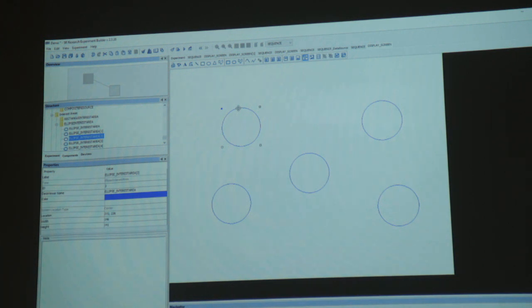Again, the participant cannot see what the interest area is, so it does not matter what shape you use. If it's a circle object, you use a square interest area, it does not matter. The only difference is it doesn't fit correctly. So you would want to usually technically match the shape of your object, if you can. Otherwise, just use a circle for everything, because it is more uniform everywhere in all axes.